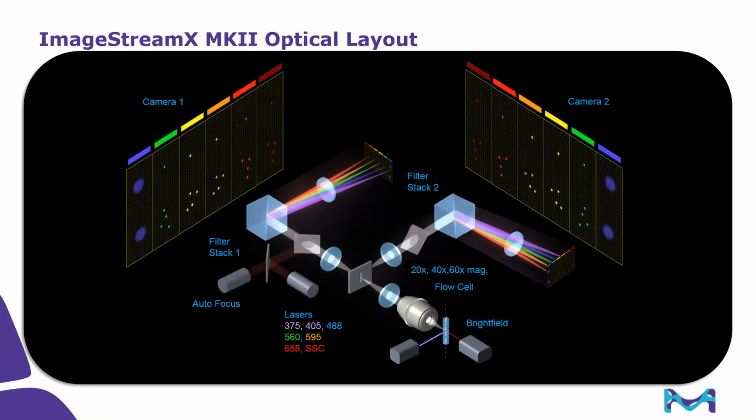Now, the platform is designed to image all of these images simultaneously. What that does is enable our throughput, again, up to 5,000, potentially 10,000 objects per second. What you're looking at here is just a cartoon of the optical bed. So samples are prepared in suspension, just like you would for flow cytometry. The cells are then taken into the system. They're hydrodynamically focused in a quartz cuvette.